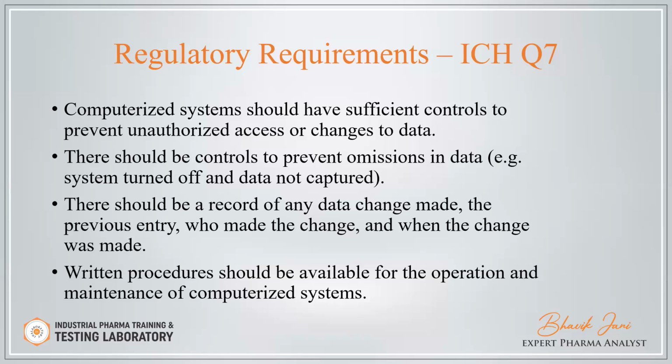Many times in a QC, what happens? The analyst shuts down the instrument or shuts down the computer, so data will not be captured. If this happens in your lab, you have to give some mitigation plan for that. Whenever the analyst turns off the system, the software, or the instrument, data should be captured.